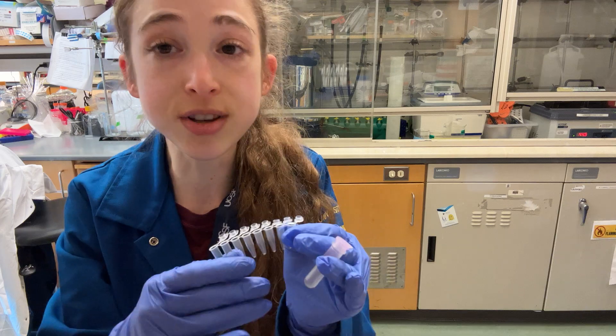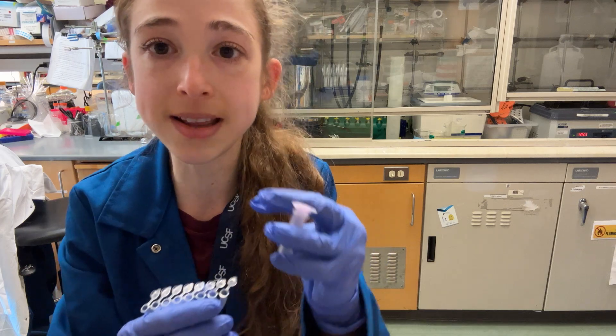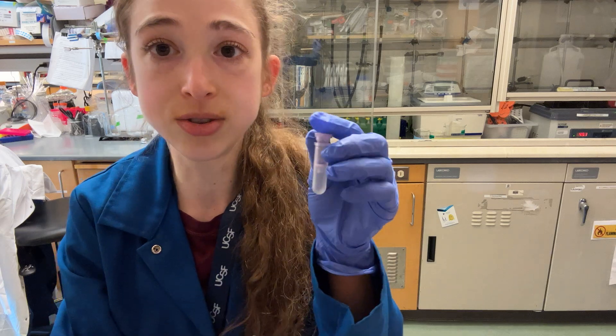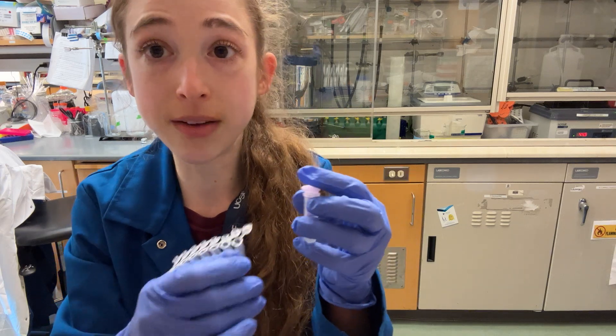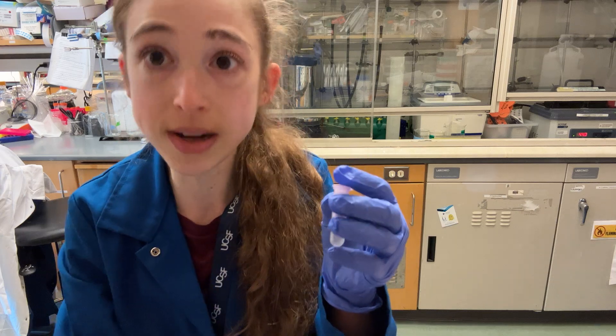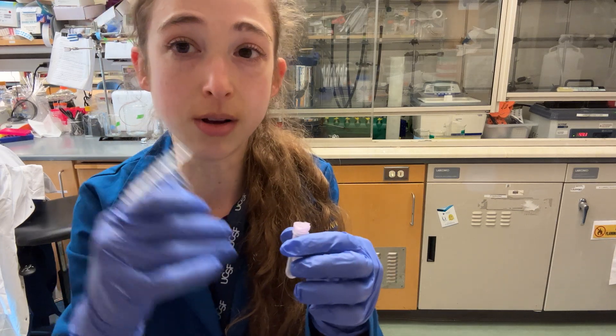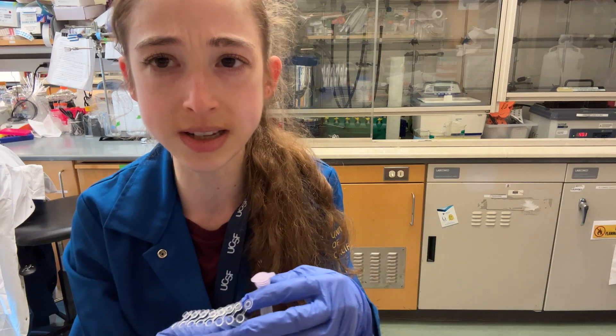Then at the end, you can just pool those all together and combine them during your purification step. You can basically just load them all onto the same column one after another. If you have too much volume, you can load it, spin it, load it, spin it. If it's not too much volume, you can just load it all together at the same time and spin it once.